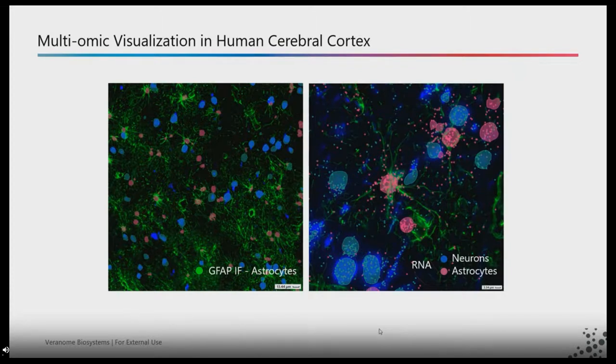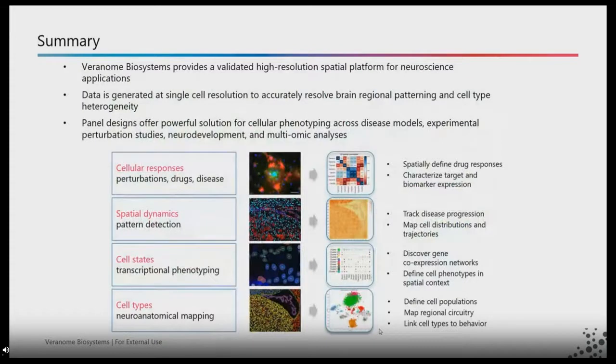You can see the red groupings are RNA-based markers that are overlying most of the astrocytes. Blue is for the neurons, so a little bit higher-resolution view of that on the right. So those are some of the features that we've got with analyzing neuronal types, particularly in the mouse brain.